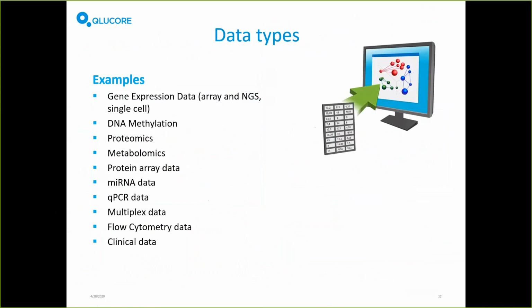We can input lots of different kinds of data types into Omics Explorer, and basically any kind of data which is expressed as large matrices of data is possible to import. So basically anything you can open in Excel or paste into Excel, you can also load into Omics Explorer. Initially, the software was developed for array data, but basically any sort of tabular data can be input to it.